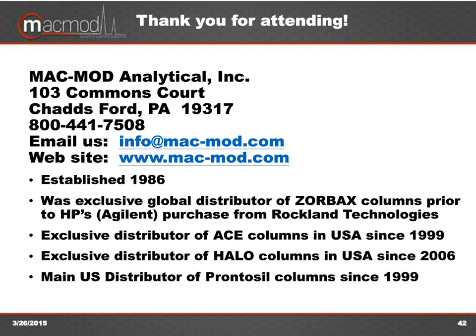I'm sorry if I gave that impression. Actually, that is a technique that is being considered, more about putting two different phases in tandem directly to give you kind of a composite phase, if you will, or composite column. But what I meant was putting two columns of the same stationary phase in tandem to give you twice as many plates, and of course the square root of 2 times the improvement in the resolution.